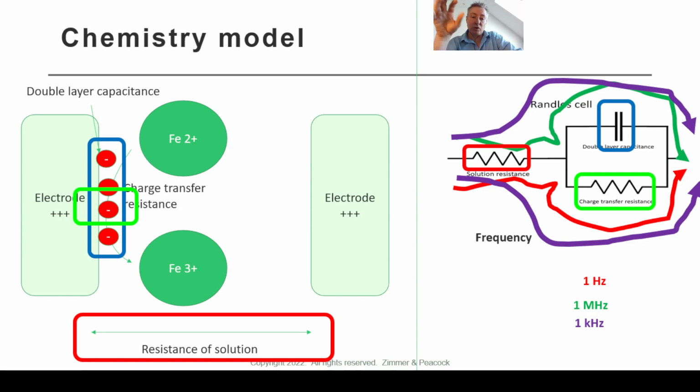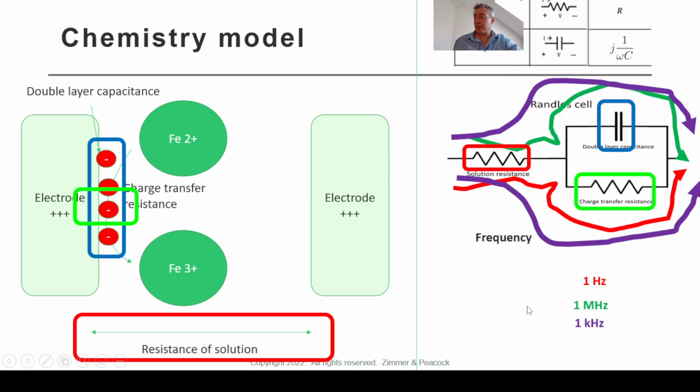And what the software is then able to do is take those signals, come up with what's called the equivalent circuit, and examine these elements as a function of concentration. So I show some data where I went from 5 nanograms per milliliter up to about 75 nanograms per milliliter, because these elements, especially the capacitive element and the charge transfer resistance, will change the more you bind to the surface.